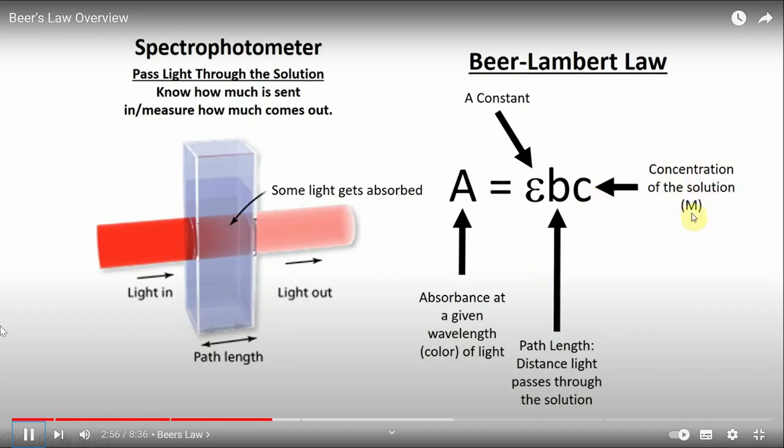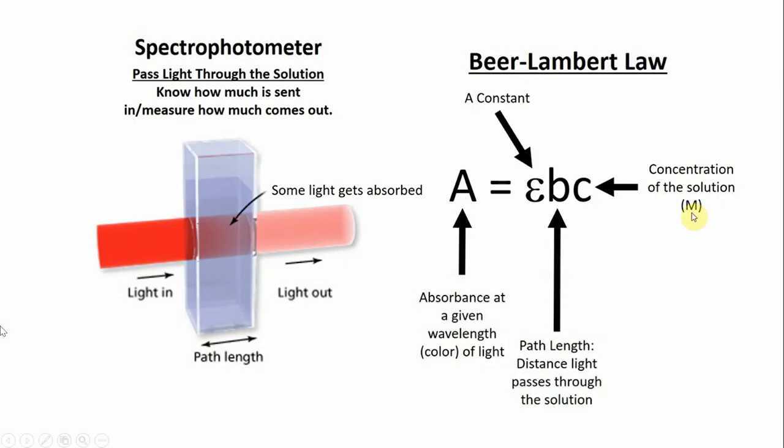And the concentration, which here I show in molarity because chemists work in molarity very commonly, but the truth is, Beer-Lambert law works for any concentration unit as long as you're consistent.